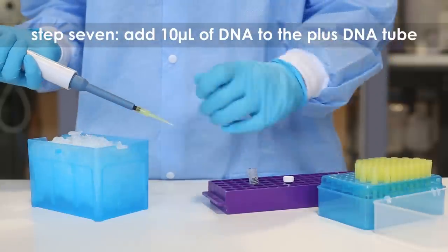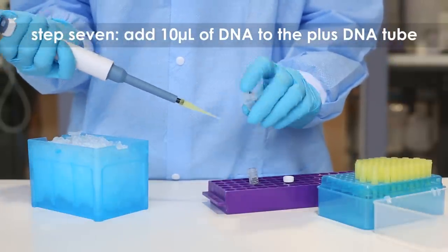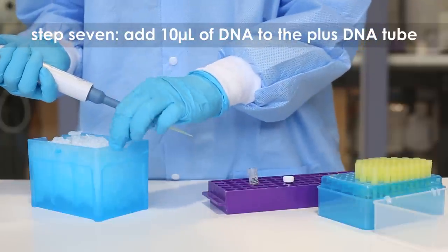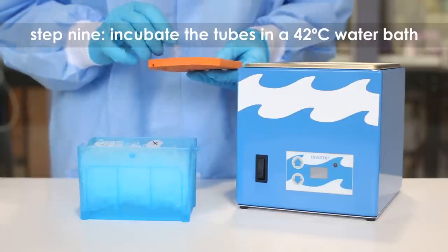Step seven: add 10 microliters of plasmid DNA to the tube labeled plus DNA. Step eight: incubate the tubes on ice for 10 minutes.